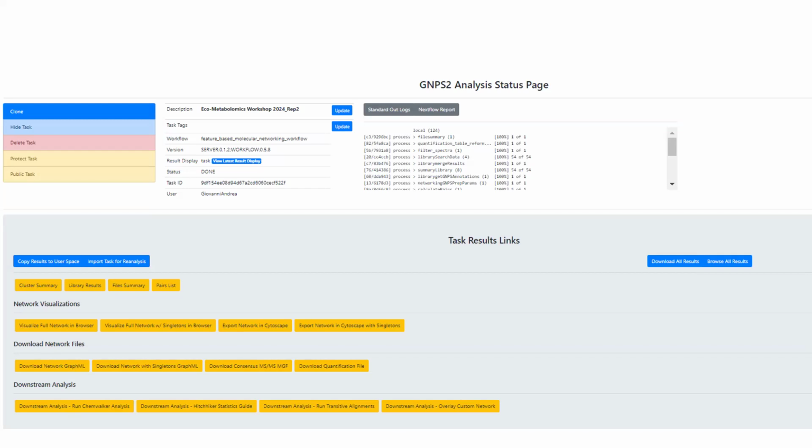I was working on the subsurface protein. We got a bunch of metabolites from the subsurface samples, but we could not find in the literature what their role is. People tell us to remove them, maybe as a kind of contamination. Now you have shown this bacterium from the sediments, and you got metabolites related to tryptamine and serotonin.